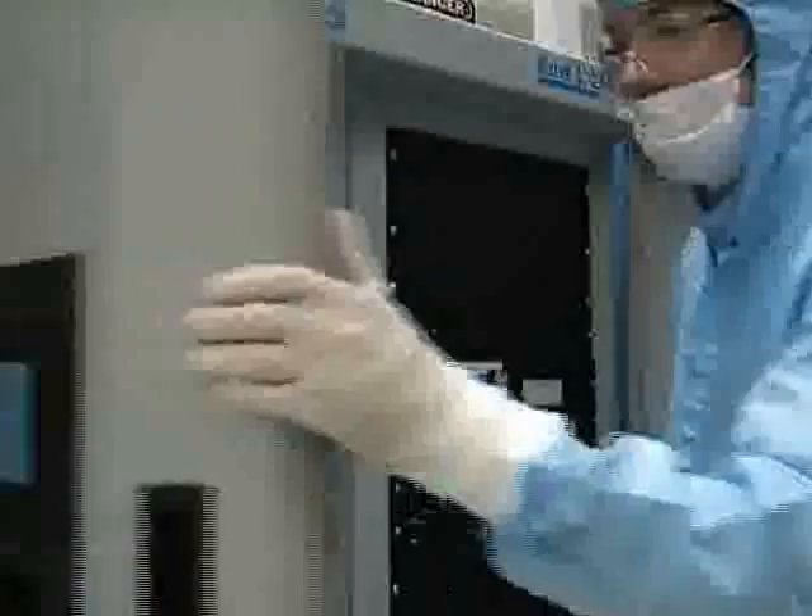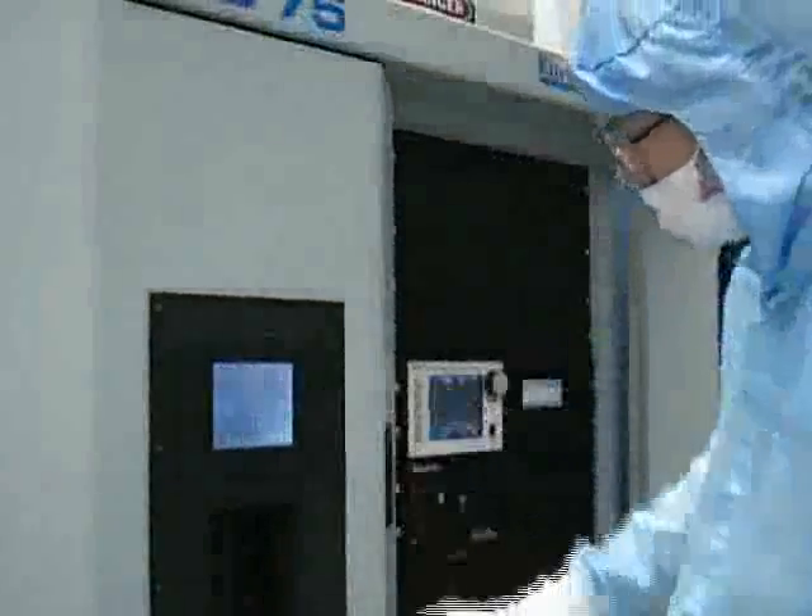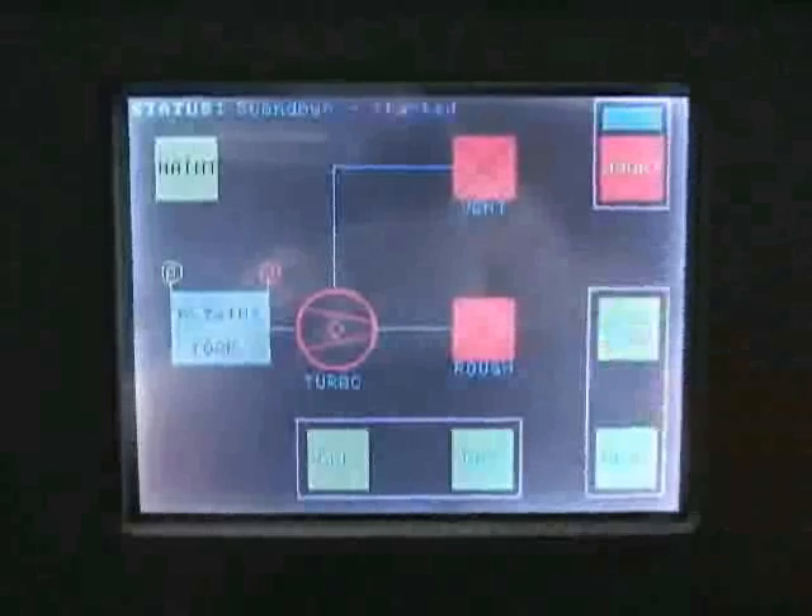When you are ready to pump the system down, close the chamber door and press pump down on the front panel touch screen. The chamber pressure will be indicated in Torr on the left side of the screen.